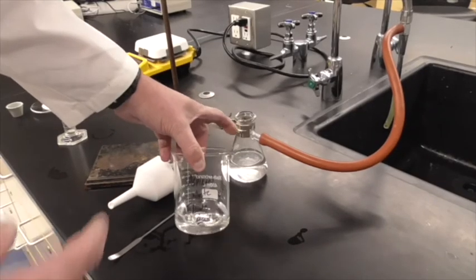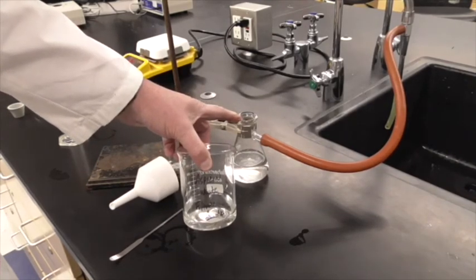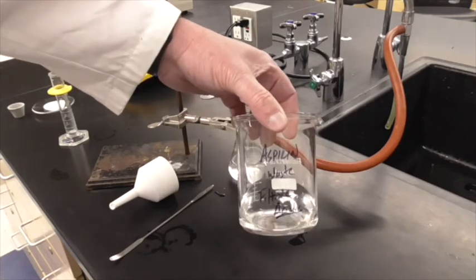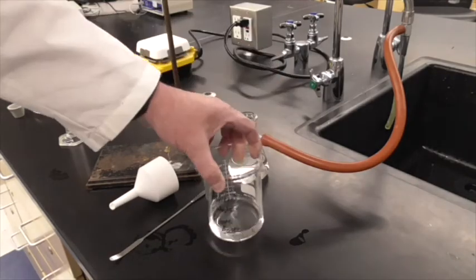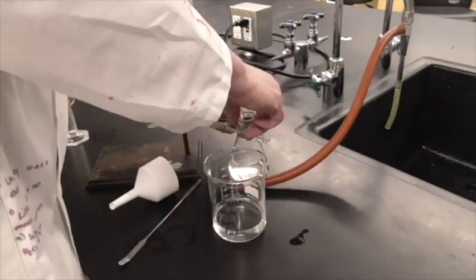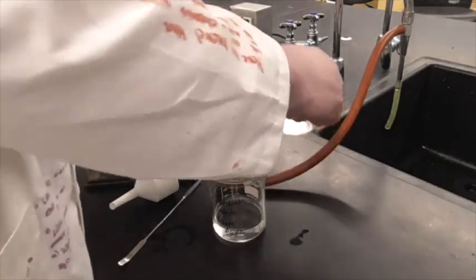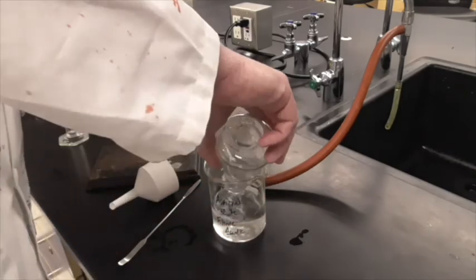Alright, so I need to clean up that liquid that was filtered through. I know it's really acidic because it's got the sulfuric acid in it. So what I've got is a waste container. It's labeled as aspirin waste from the filtrate, and it says acidic on it. I just got this out of the hood, so I'm going to dump this solution in here, just so we can neutralize it and not dump it down the sink, because you can't dump acidic things down the sink.